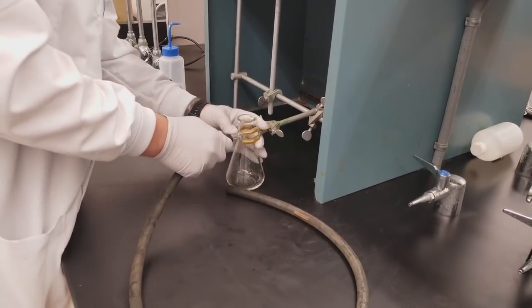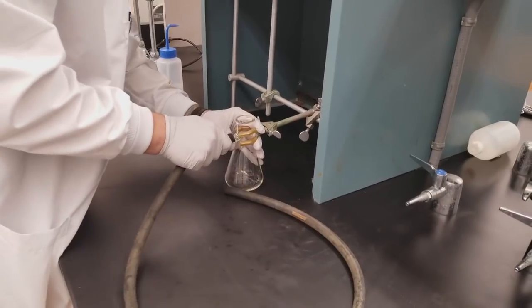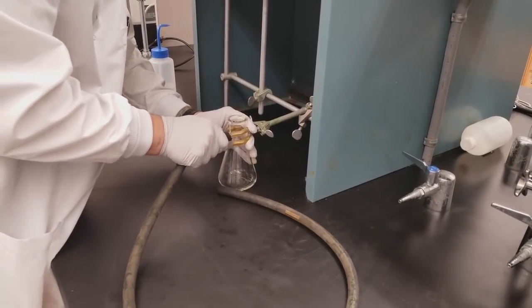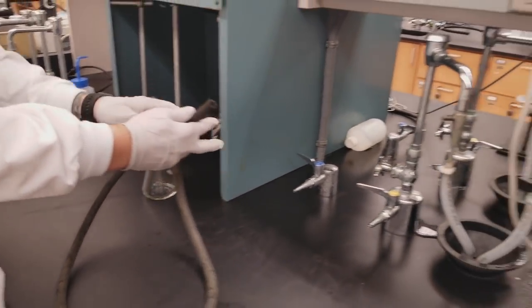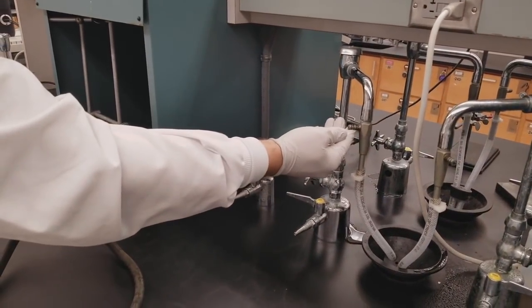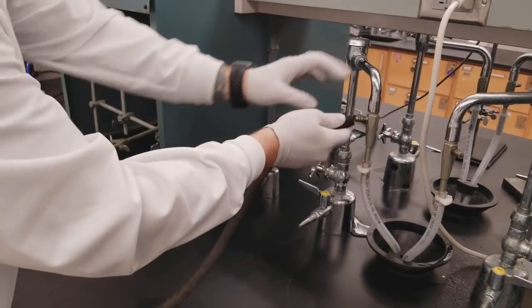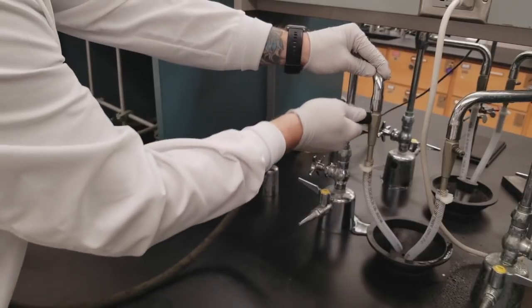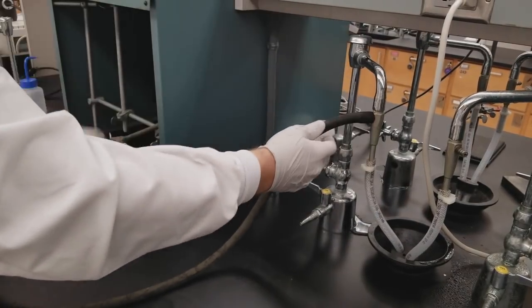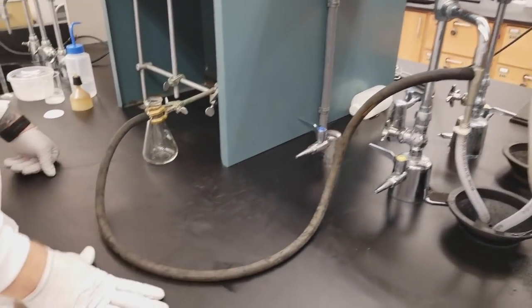So we're just going to attach that to the arm of the vacuum filtration flask and then the other end is going to go on to the water aspirator in the lab. So attach that to the water aspirator and then we're ready to go.